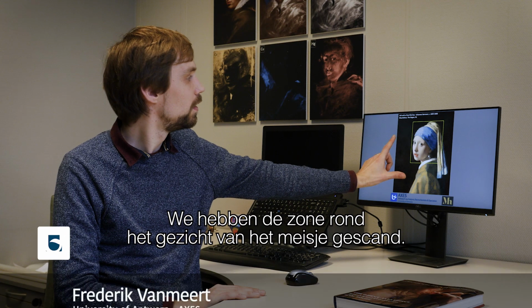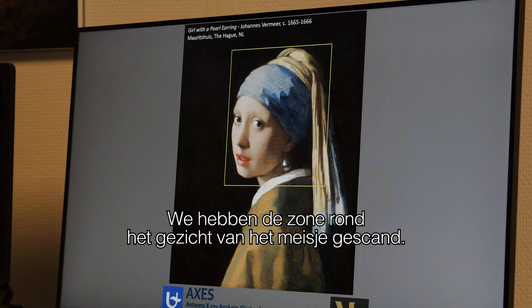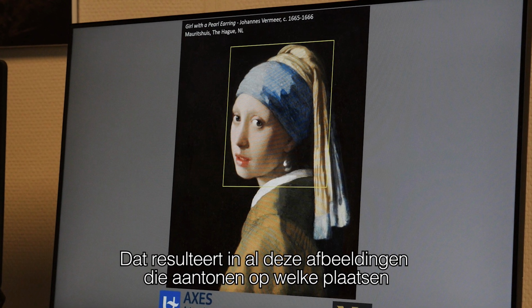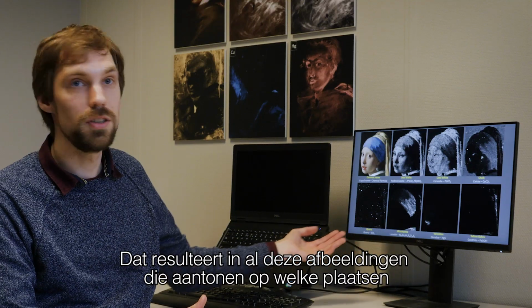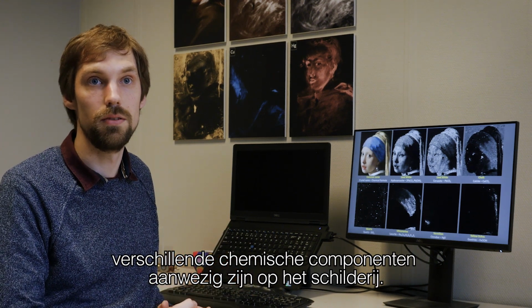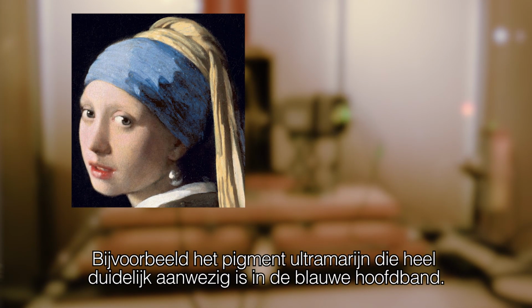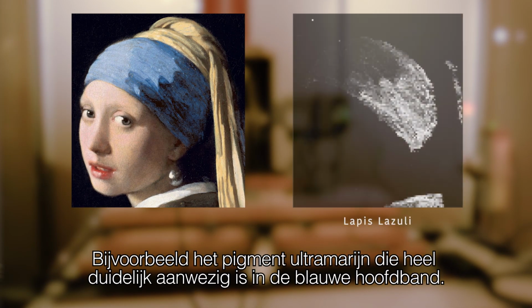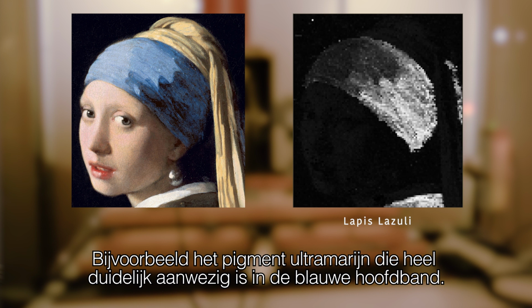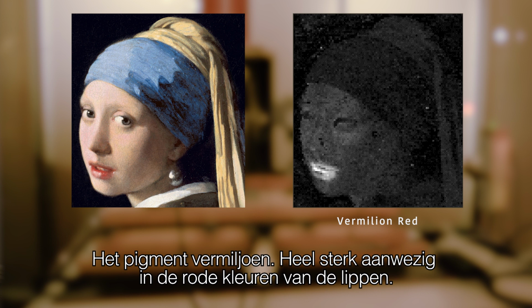We were able to scan the face of the girl using our instrument, and as a result we actually get all of these different images which show where different chemical compounds are located within the girl with the pearl earring. We have, for example, the pigment ultramarine, used abundantly here in the blue headscarf of the girl. We have the pigment vermilion, which is present in the red tones of the lips of the girl.